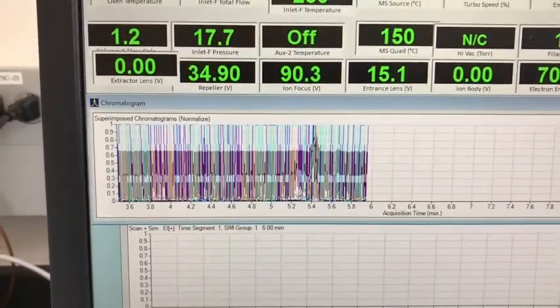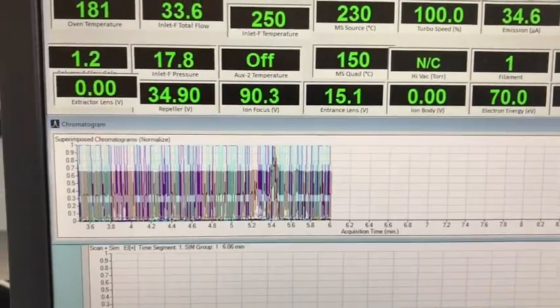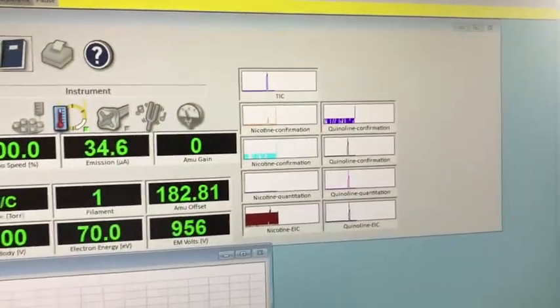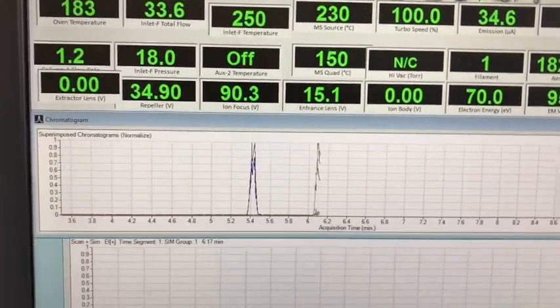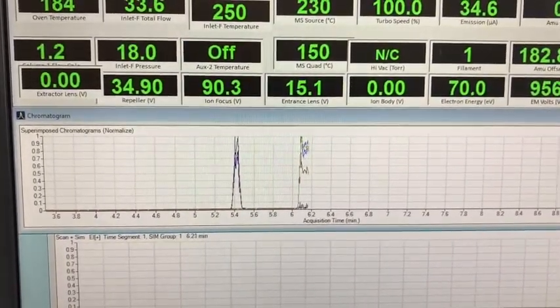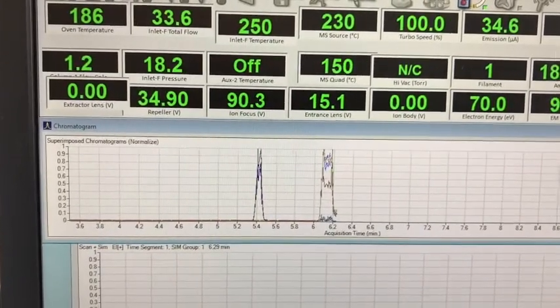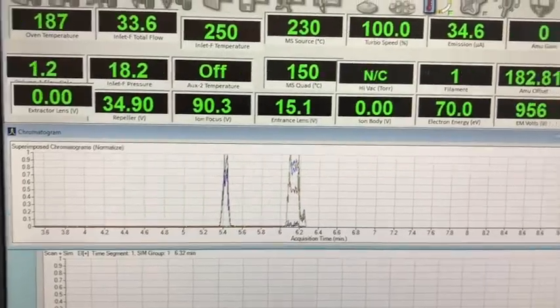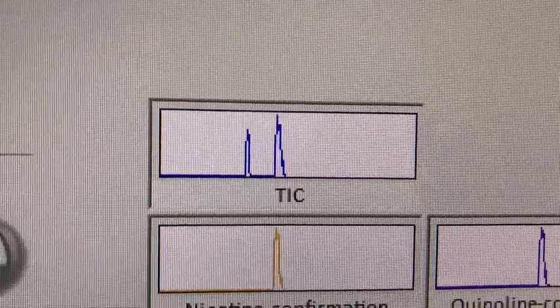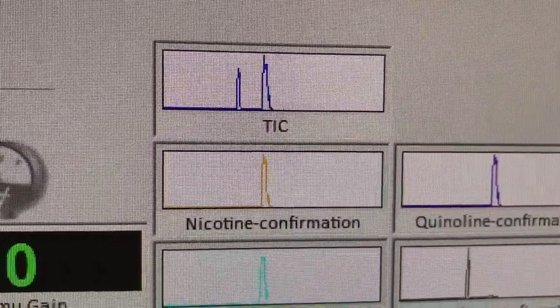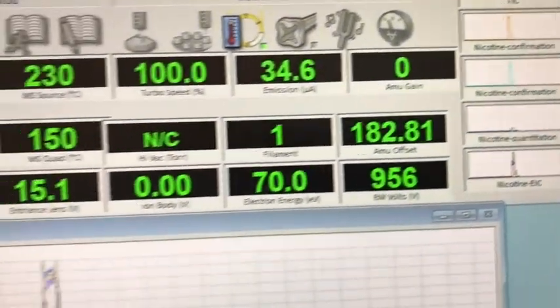There are multiple peaks being overlaid, which is why we see it like a big noisy baseline. But we get a clear value here. Now we are going to get nicotine as well. So first came quinoline and then comes nicotine, as clearly seen in our total ion chromatogram. We have now confirmed both quinoline and nicotine.